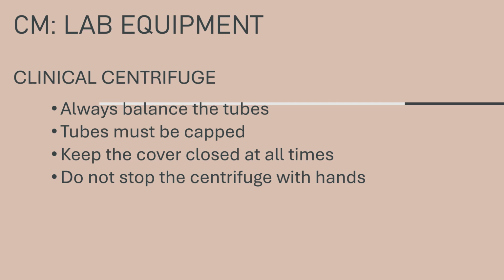You make use of your photoelectric tachometer or your strobe tachometer to check the RPM of your centrifuge, and also periodically check your timers and speed controls. Also, inspect your power cords, the lid lock, and internal components for damage.